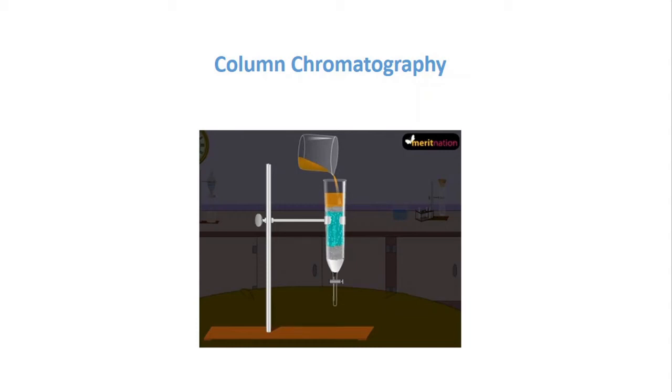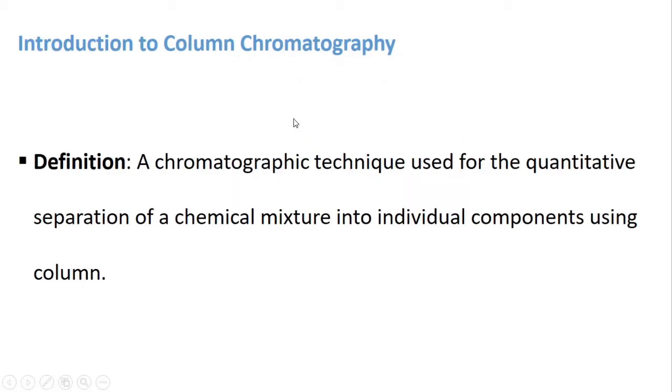Hello everyone. In this video, I will explain column chromatography, its definition, principles, how to use it for the effective separation of chemical mixtures, and what are other applications of it.